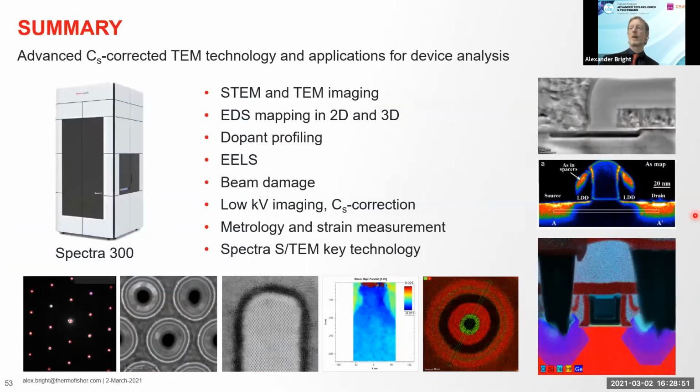So thank you very much for listening. I mainly talked about STEM and TEM imaging, EDS mapping, dopant profiling, EELS, beam damage, low kV, metrology and strain measurement, and some key technologies of Spectra. Thank you very much.